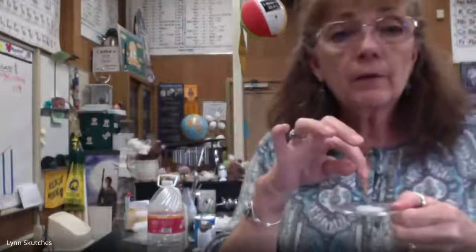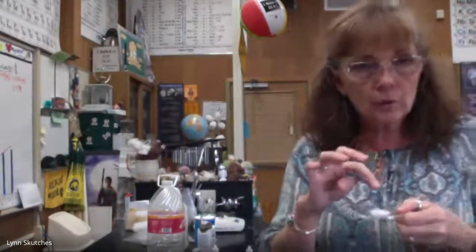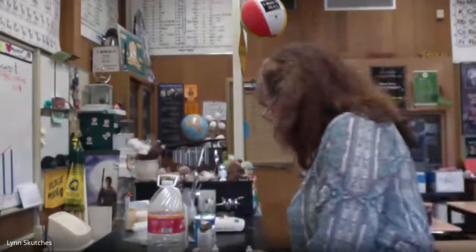Okay. So again, on your table, or at the bottom of the first page, red for acid, green is neutral, and purple blue is for bases. And so you should have that information in your head. And what you're going to do for your predictions is you're going to predict what's going to happen. What do you think is going to happen when I put universal indicator on the salt, on the baking soda, and in the vinegar?